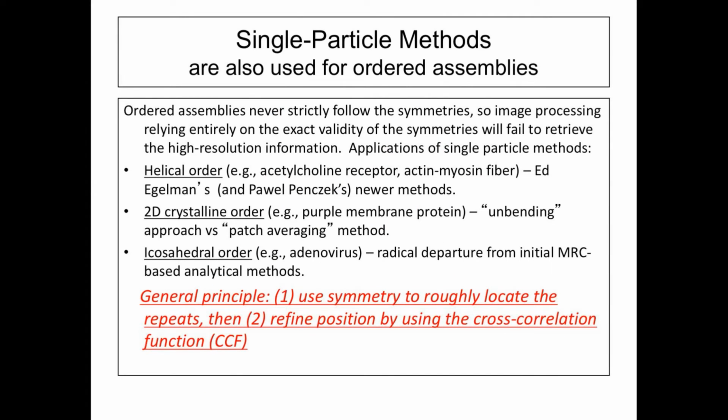Okay, I just want to note in passing that single particle methods are also used for ordered assemblies, and wherever there were Fourier methods that made the process very easy for ideal arrangements of molecules, all these have been switched to single particle methods, because it always turned out that in reality we have non-ideal crystals, and to maximize the information yield from the images, it always pays out to capture very small portions and then find the actual arrangement of them.